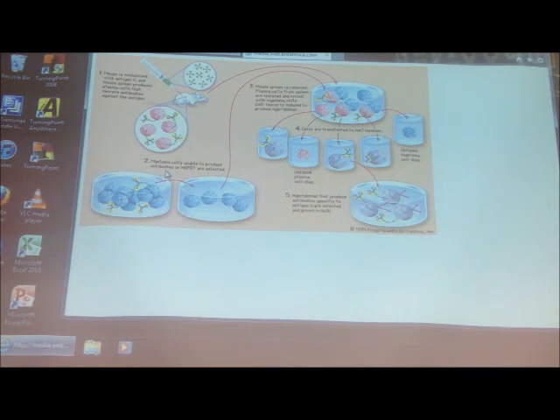Some sort of cancer, so it's immortalized. So it's an immortalized cell line. We'll take those and fuse them with the spleen cells, and we'll create hybridomas. Now, the next step is we have to somehow differentiate between the hybridomas, the spleen cells, and the myeloma cells. So that's the trick. Once you fuse them, how do you separate them?